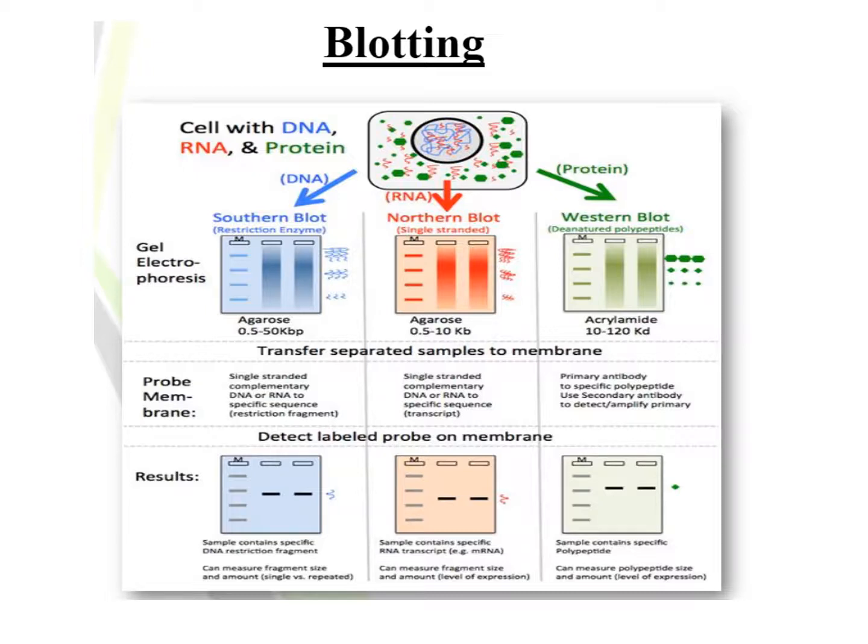electricity, because remember the proteins are still charged, and we have another set, and of course the plates will be horizontal instead of vertical, and the protein moves across and hits the nylon membrane. So go back to that figure before, and those bands or spots end up in the same location that you separated them, and that's the key, same location.